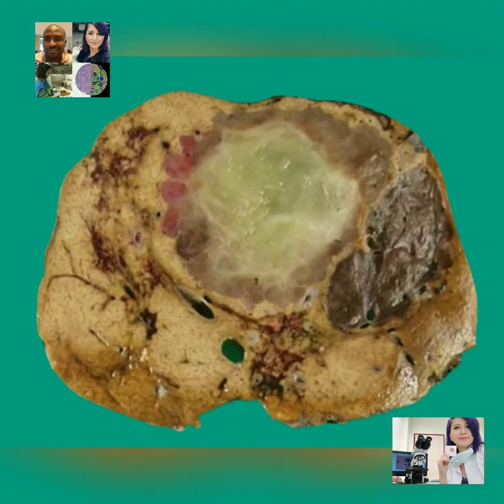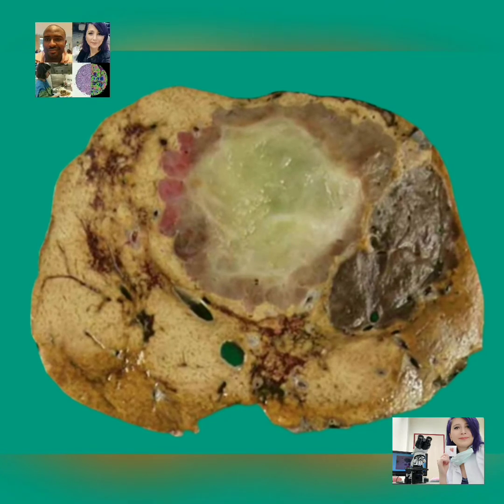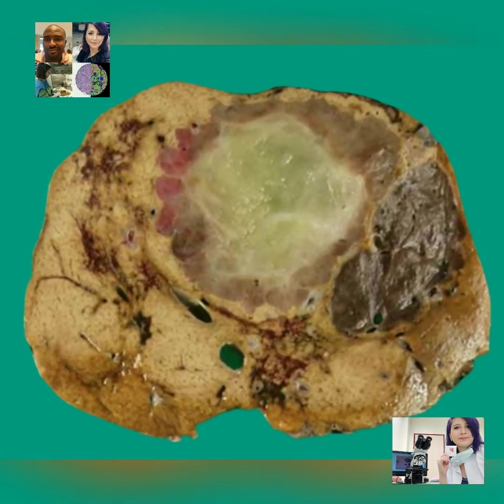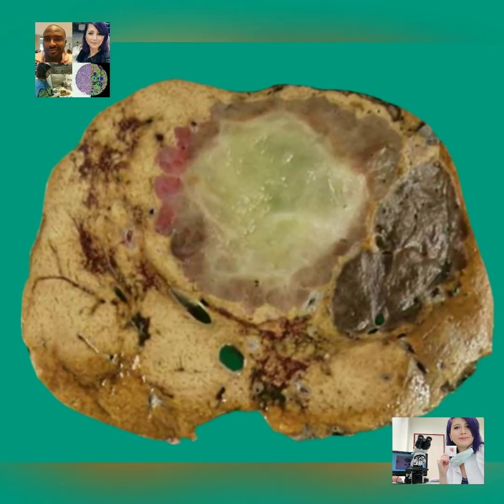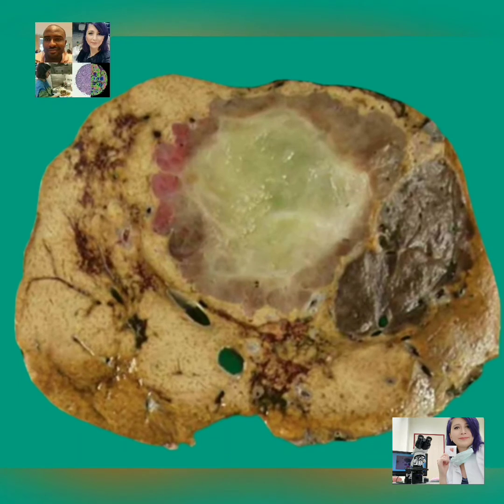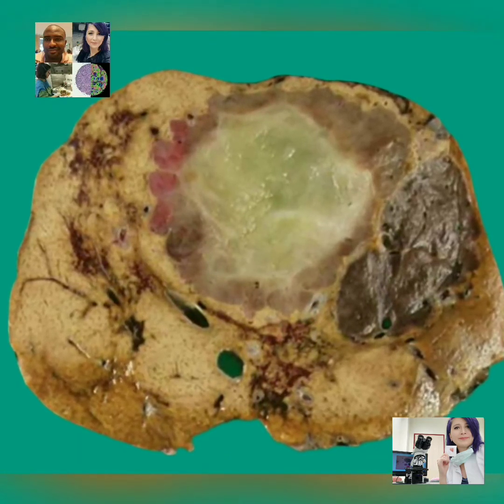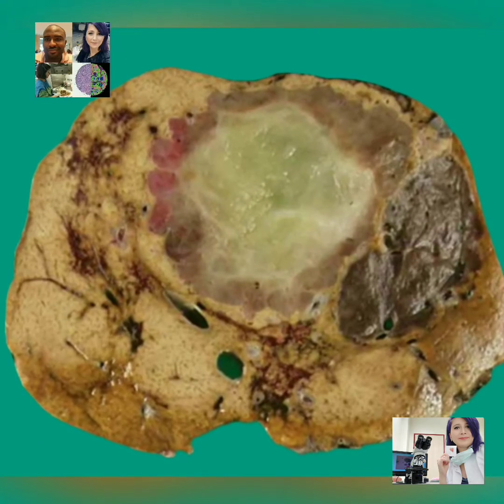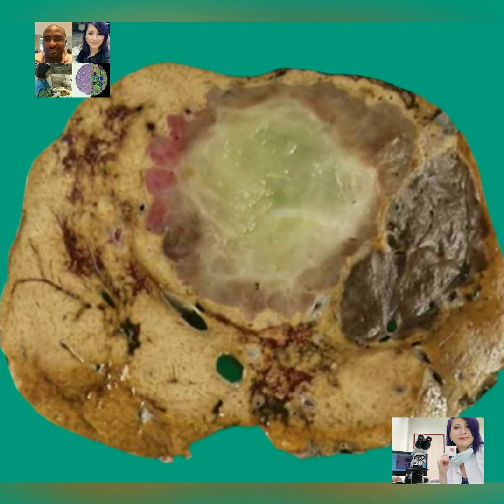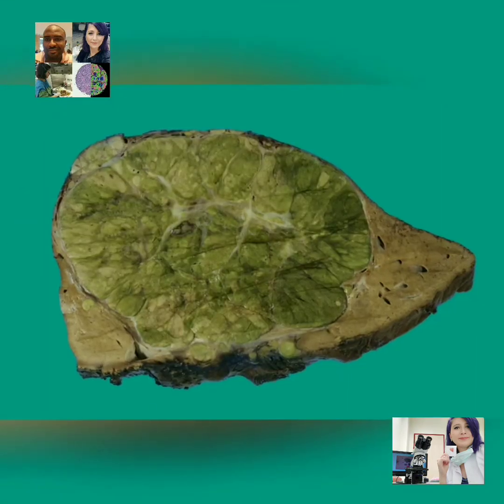So, on receiving the liver biopsy in the lab, a few things should be noted or considered. First, has the biopsy been received fresh, or has it been placed in a fixative? If it has been placed in a fixative, what type of fixative was used? Is it formalin or non-formalin based? Some special fixatives like glutaraldehyde may be required for special studies like electron microscopy. The nature of the disease or procedure being done may require examination of fresh tissue.